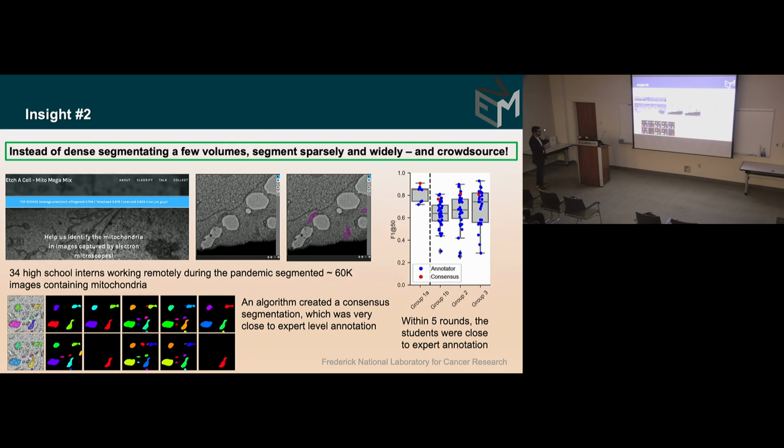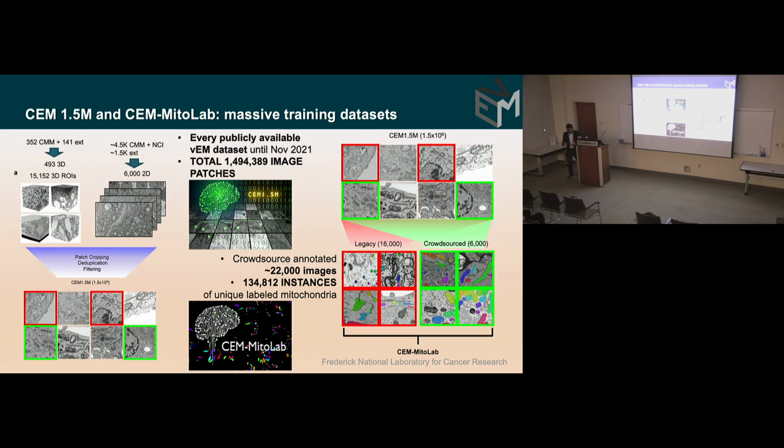And the way we did that task was to give it the ground truth, right? This was mitochondrial labeling, and we had a huge number of interns who, over a period of time, taught the AI, the deep learning model, what mitochondria are. So we took, as I mentioned, something like 2 petabytes of data. We did some clever computations that I'm not going to get into. We then added to it 135,000 examples of unique mitochondria. And then we used all of this to train the model.